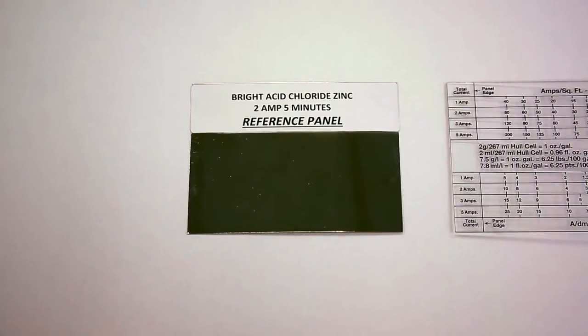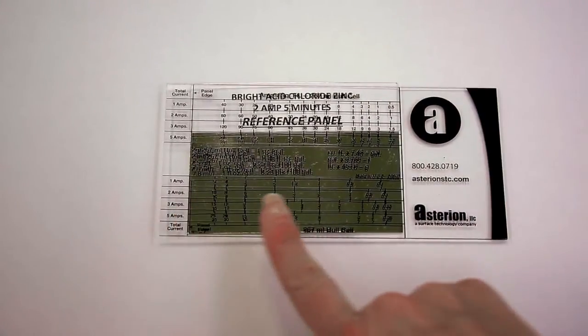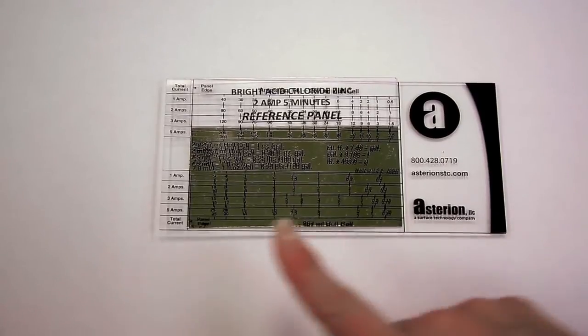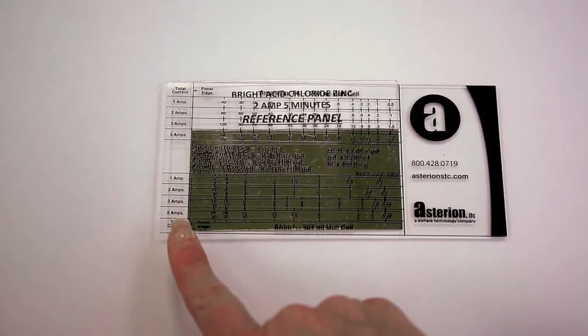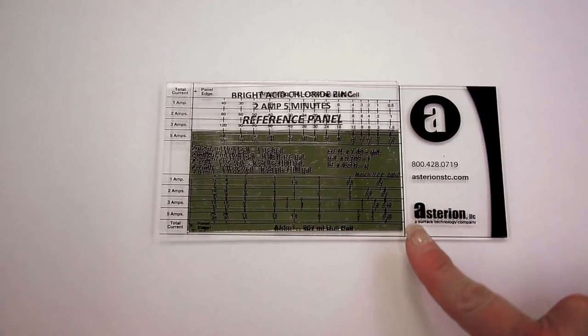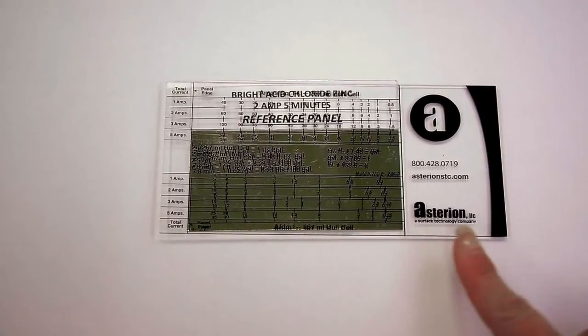Hull cell evaluation. Simply put, the hull cell ruler is laid on top of the completed hull cell panel. The grid of the hull cell ruler provides a reference to evaluate the plating across a range of current densities. The high current density is located on the left side of the panel, closest to the anode, while the low current density is located on the right side, furthest away from the anode. The range of current density flows from left to right.